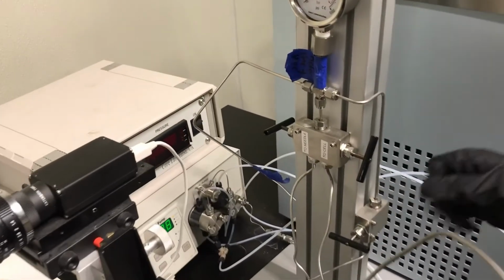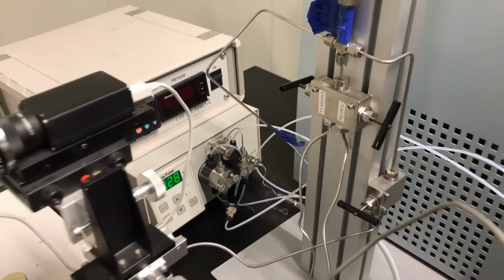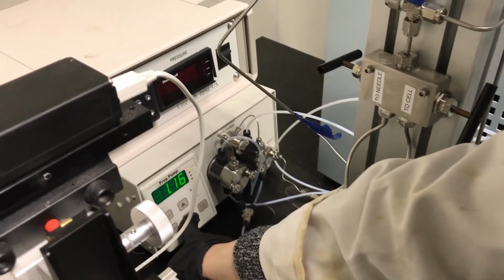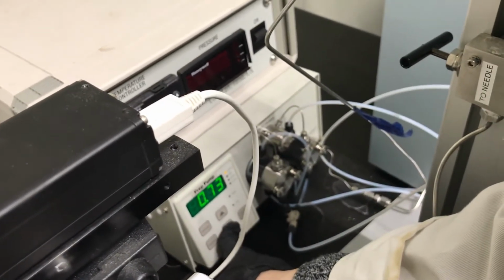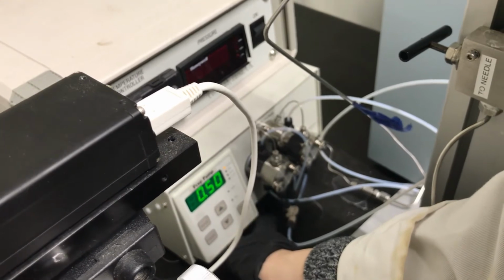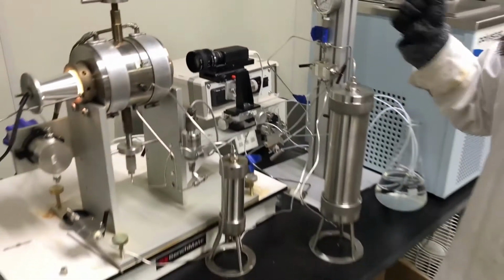And here, as I mentioned before, we only need a small volume of oil. So what we need to do is to reduce the injection rate to around 0.5. That would be perfect. And what we need to do is push the run button, and then the oil will be injected.